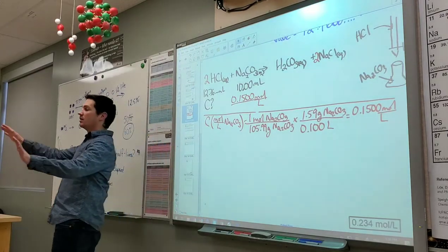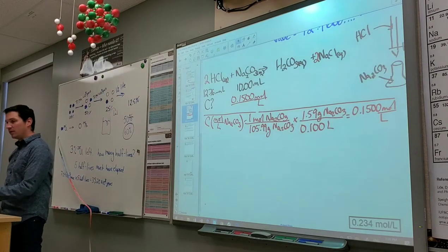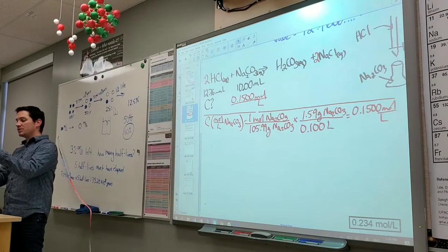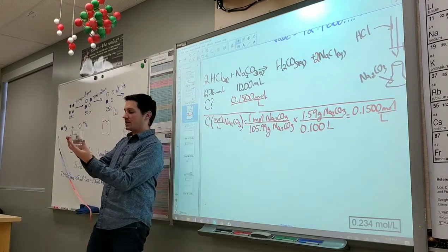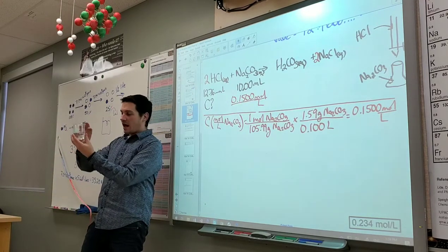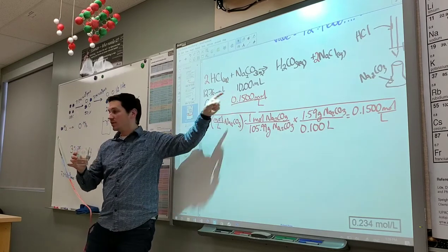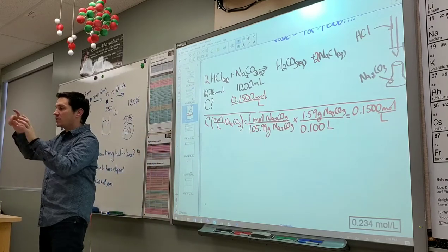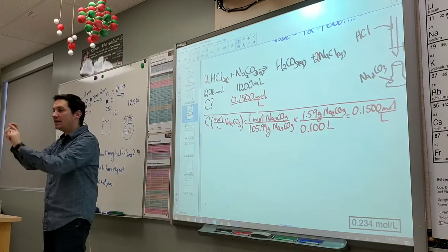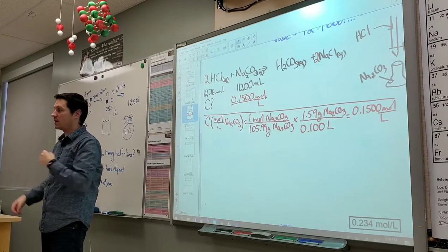Okay, let's think about this. I had a sample, right? What's the concentration of sodium carbonate in my sample? And how much volume is in there? 10 milliliters. Not the 100 that we started with. We made a big batch of it so that we could take out tiny little samples individually at a time, right? Because we want to do this multiple times.